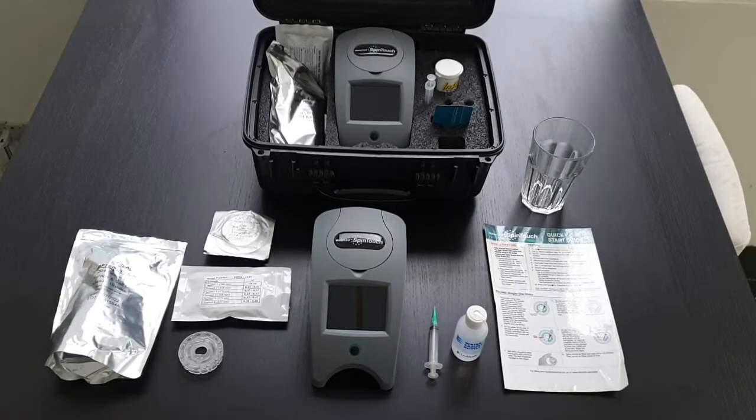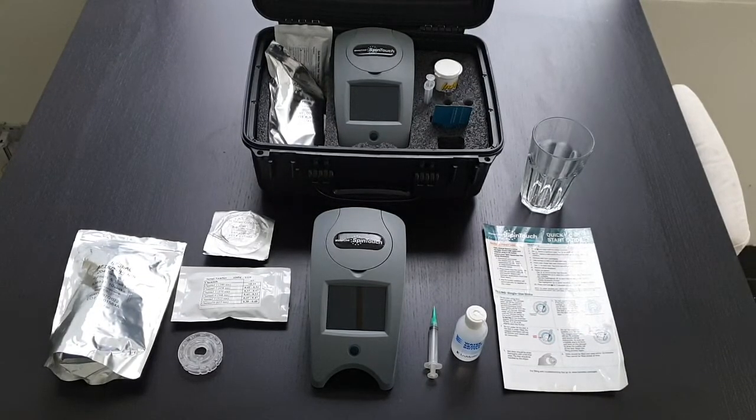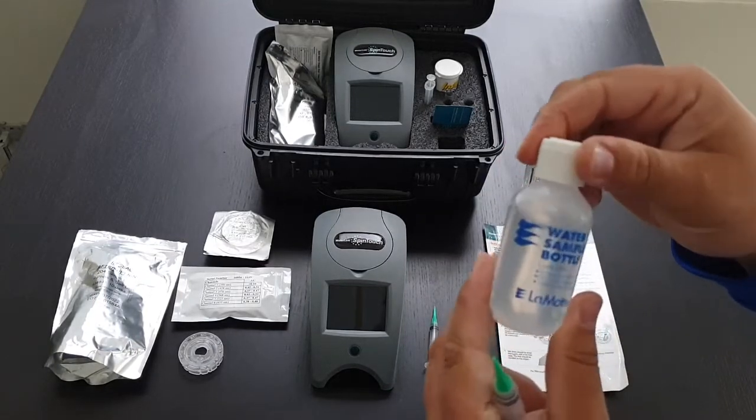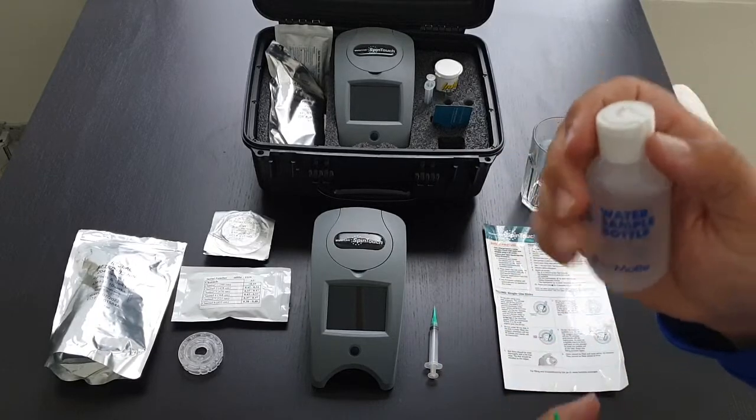How to do the Waterlink Spin Touch. First, get your sample. I like to rinse the sample bottle before filling it with the sample.